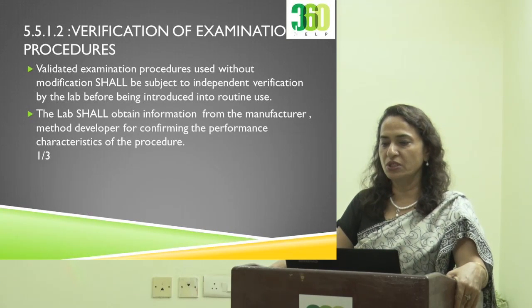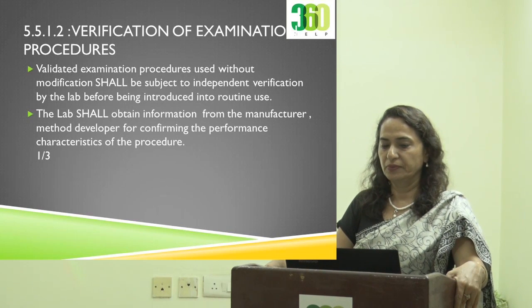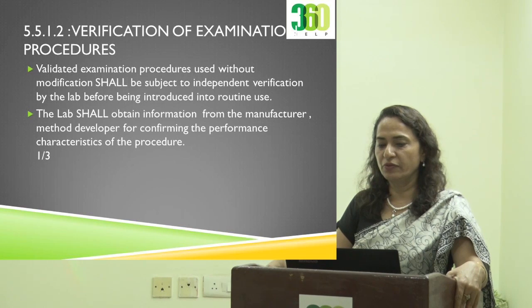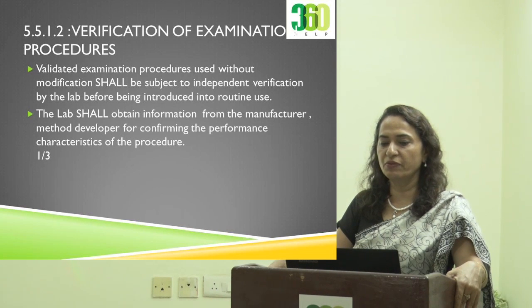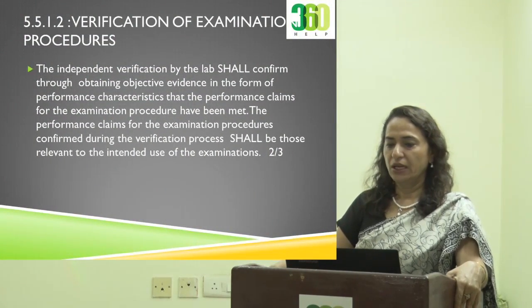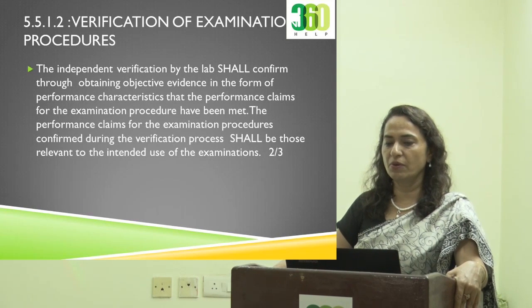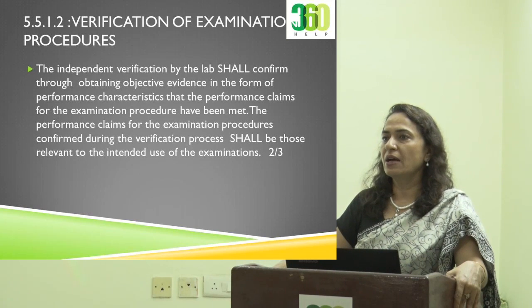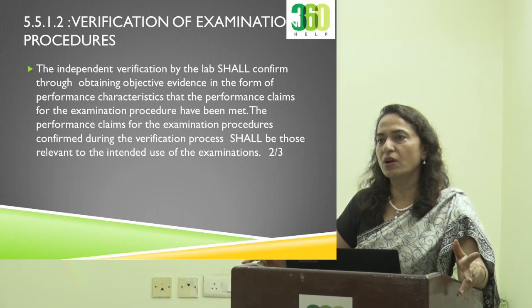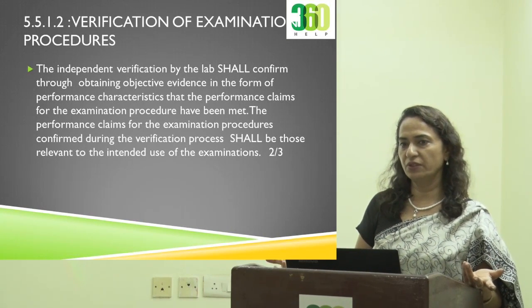Validated examination procedures used without modification shall be subject to independent verification by the lab before being introduced into routine use. Lab shall obtain information from the manufacturer, method developer for confirming the performance characteristics of the procedure. Independent verification by the lab shall confirm through obtaining objective evidence in the form of performance characteristics. So for us, the verification is through what? Performance qualification. Performance qualification of machine, performance qualification of the test.